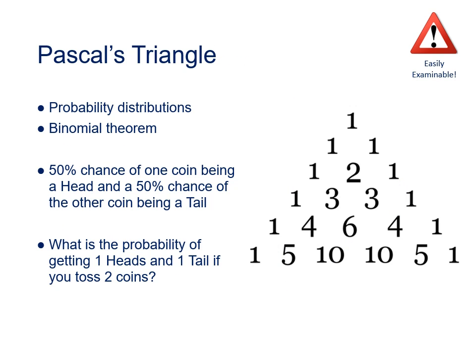And we can extend this idea of the intensities of peaks in isotopic distributions corresponding to the probability of that combination of isotopes to larger clusters. Indeed, clusters of any size. But in order to calculate the relative abundances of the peaks, we need to be able to calculate the number of different ways that each cluster can be formed. Luckily, this is a branch of maths that is well known, binomial theorem.